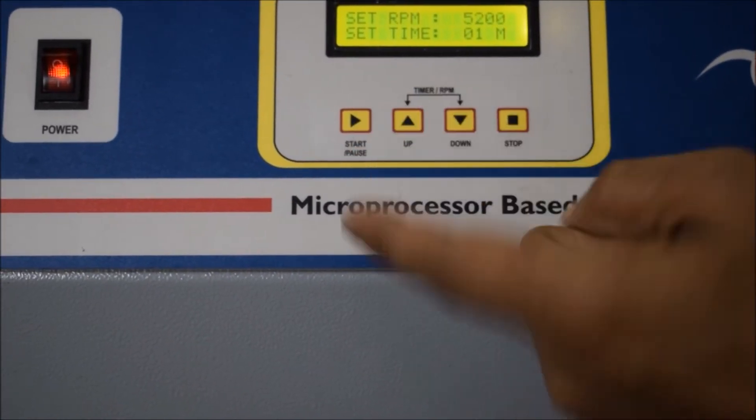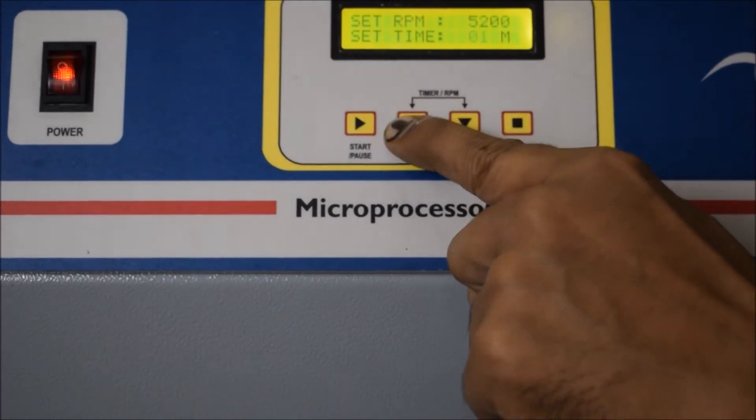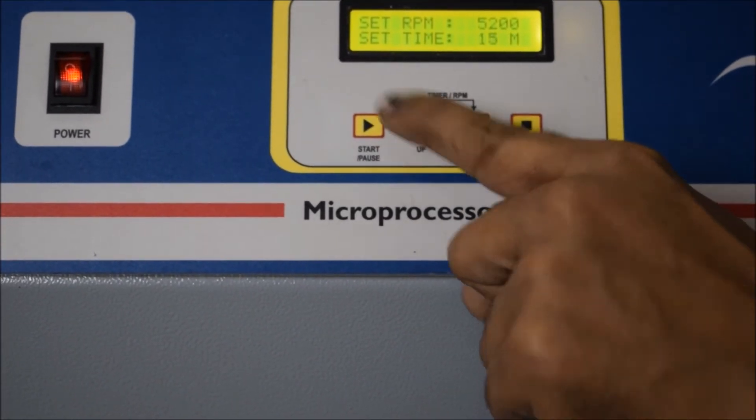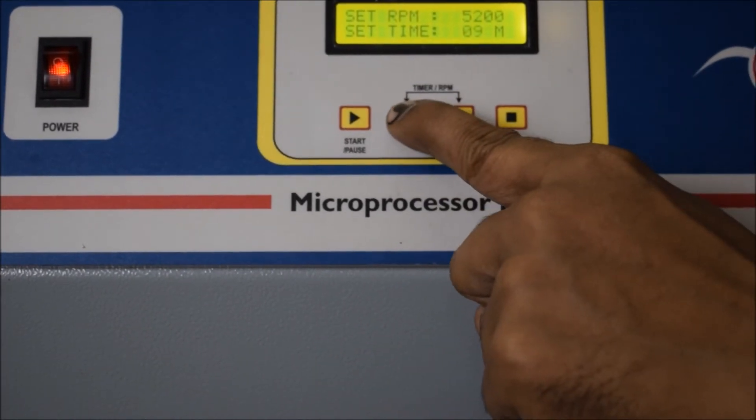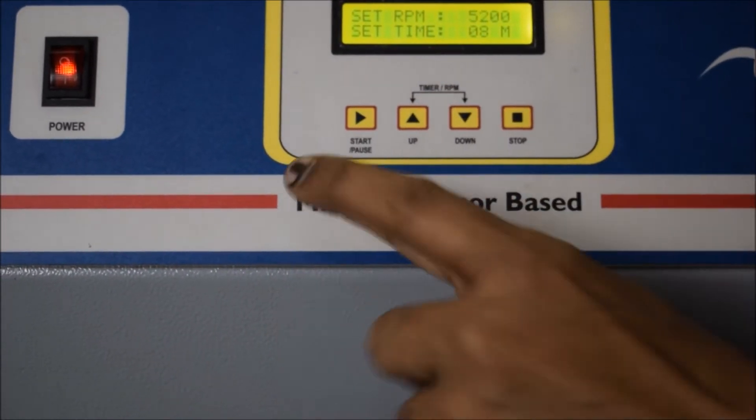Enter the proper centrifuge speed at which you want to spin your sample. Centrifugation speed is often given in rotations per minute, i.e. RPM. Set the proper RPM of the machine.